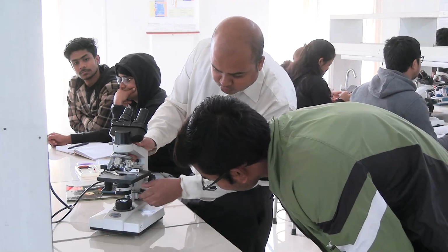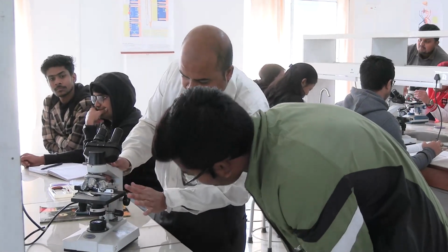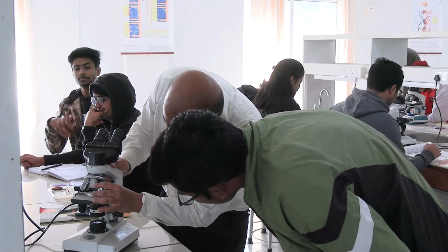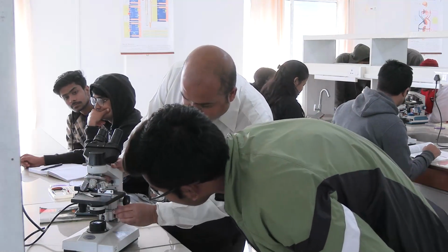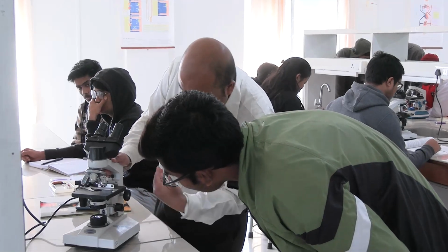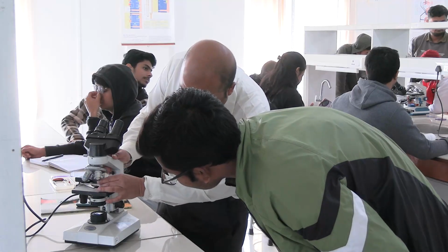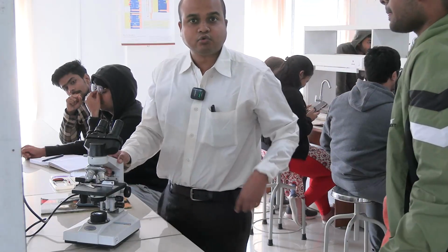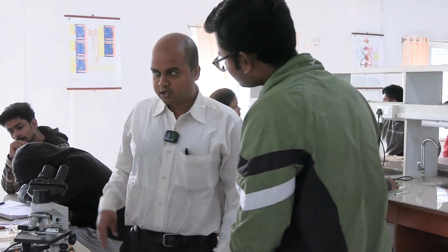When the 10x lens is used, the condenser should be in the lowest position for better focus and lighting. When the condenser is used with the 45x lens, it should be somewhere in the middle. You have to practice, and by experience you find where the light source is okay and you can focus correctly. For 100x the condenser is in the highest position. For 100x, for better magnification, we use oil, which we use during differential leukocyte count, which you have not performed.